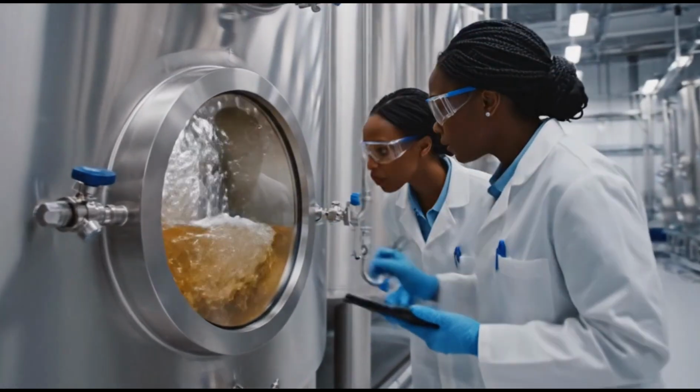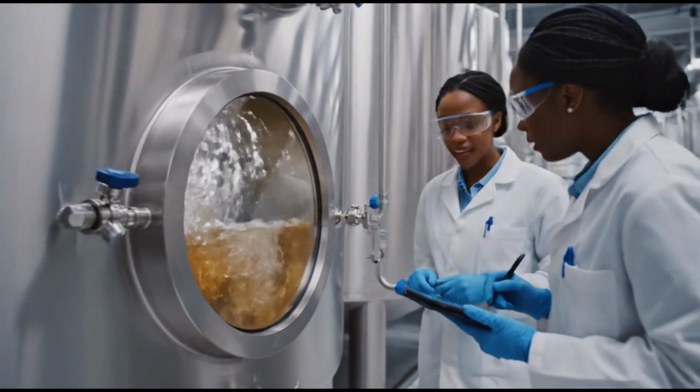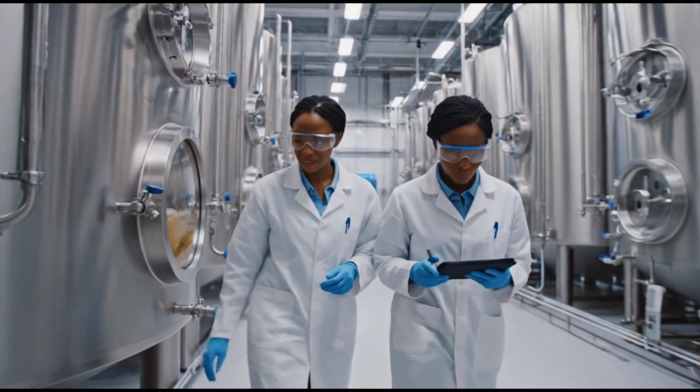Culture density looks optimal here. Agreed. Logging the parameters now, everything within spec.